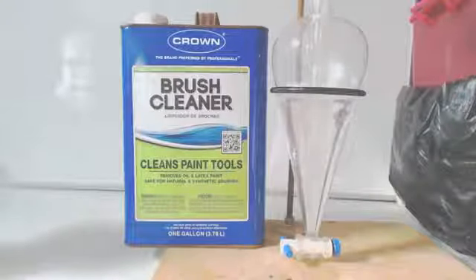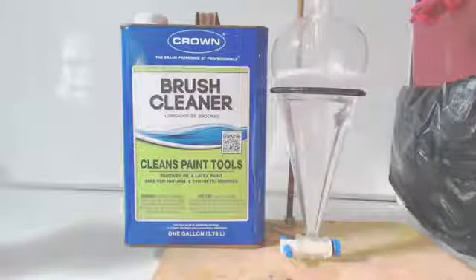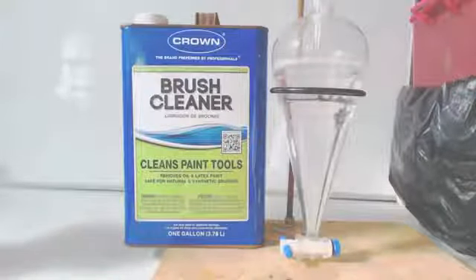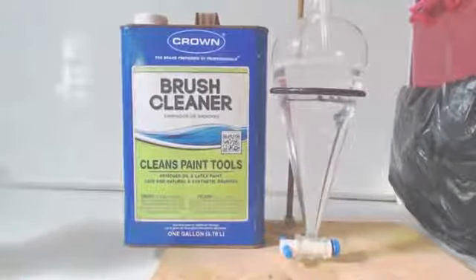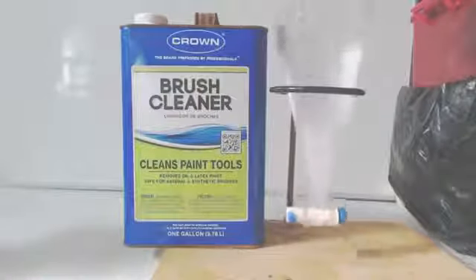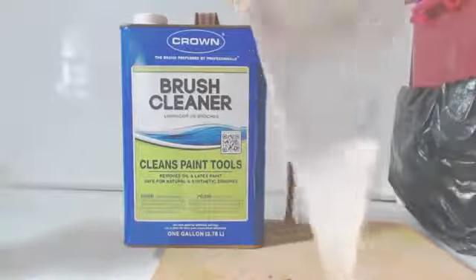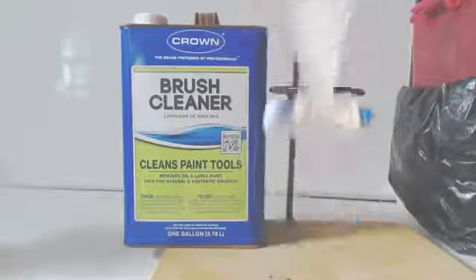This is obviously a big can, a gallon can of Crown brush cleaner. I'm going to pour it in there like I am. And I'm basically going to do the same thing as I did last time with the auto parts cleaner. I'm going to put some water in there so it forms two layers. That way I get rid of any of the small polar and non-polar things like ethanol, methanol, acetone. They only have small non-polar parts, but they have a polar part, so it gets sucked into the water. I'm going to shake that up, let it sit for about 20-30 minutes at the very least.